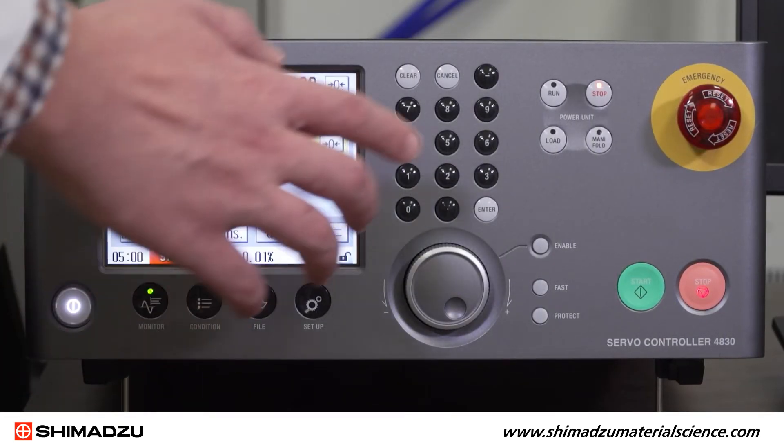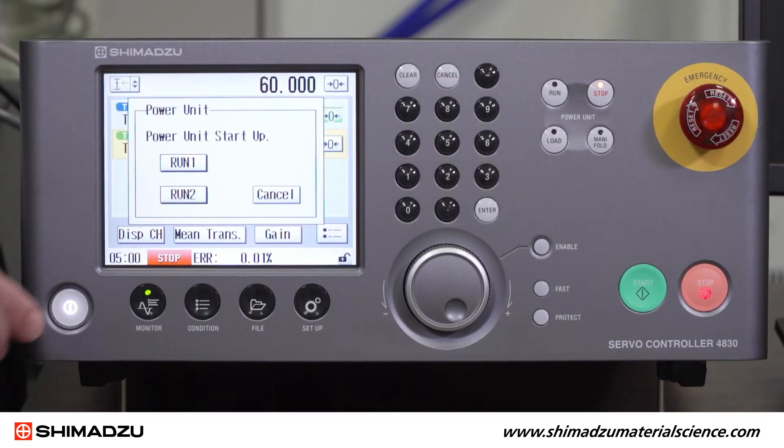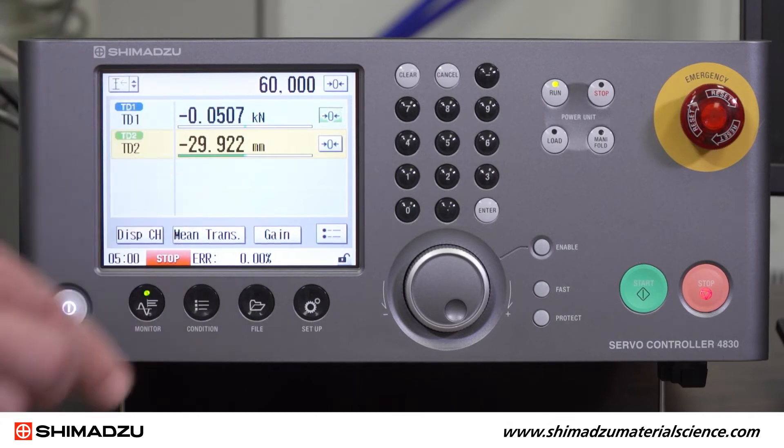Now, press the Run button in the Power Control section. From here, you will be prompted to select Run 1 when the dialog box appears on the control screen.